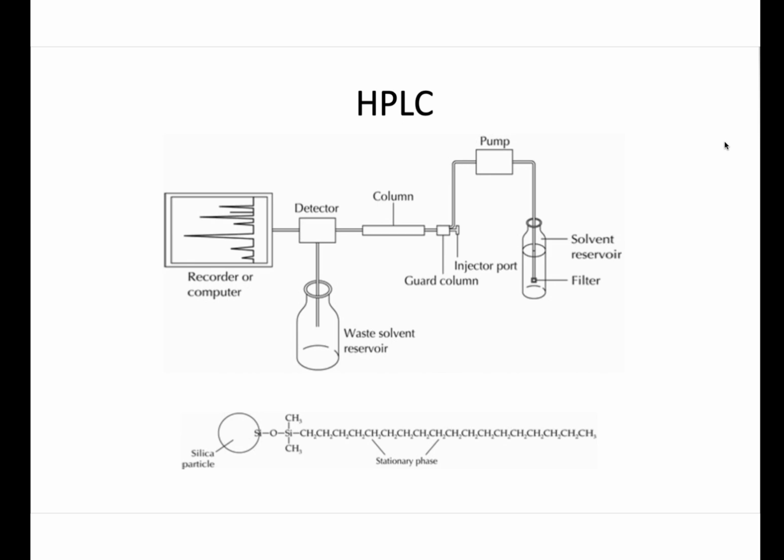You might need a 1 meter length TLC, which is impossible to obtain. The highest TLC plate is 20 centimeters, and basically we use a 7 to 10 centimeter high TLC plate. In that 10 centimeters, we cannot separate it, or we cannot have a good idea about the components of the mixture. How many components do we have?